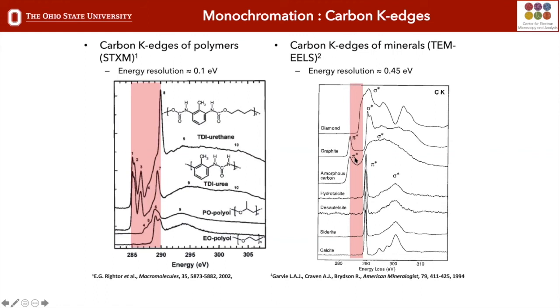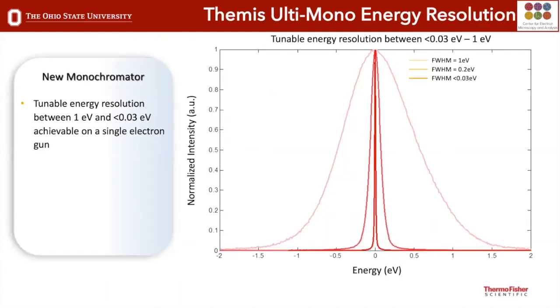So opening this up now, having this type of ability to look at bonding, to combine this with DFT calculations and simulations, it really is changing the way we can do material characterization on fine scale.